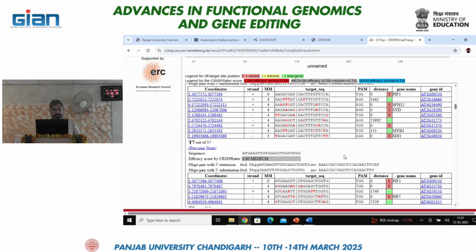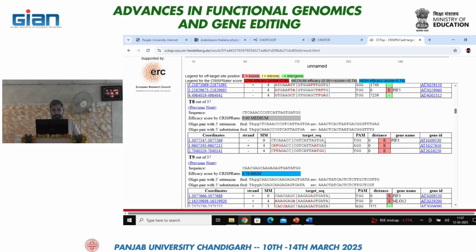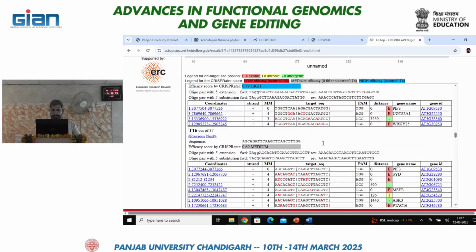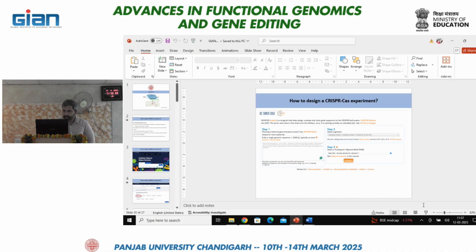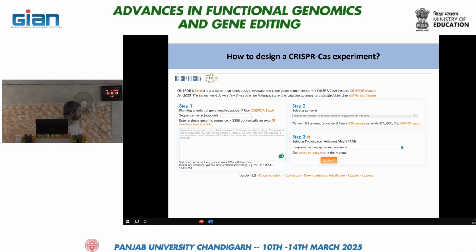Otherwise you have to select only the target region which doesn't have any off targets. Okay, so if there is any question I can take that, or we can just come back to our slides.